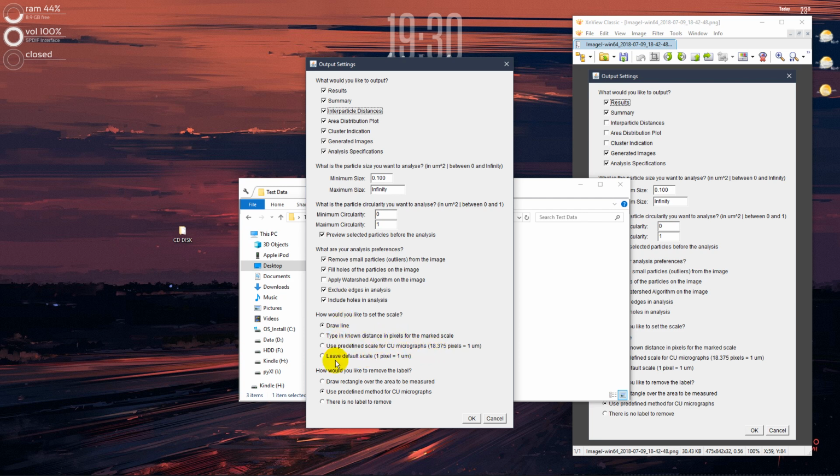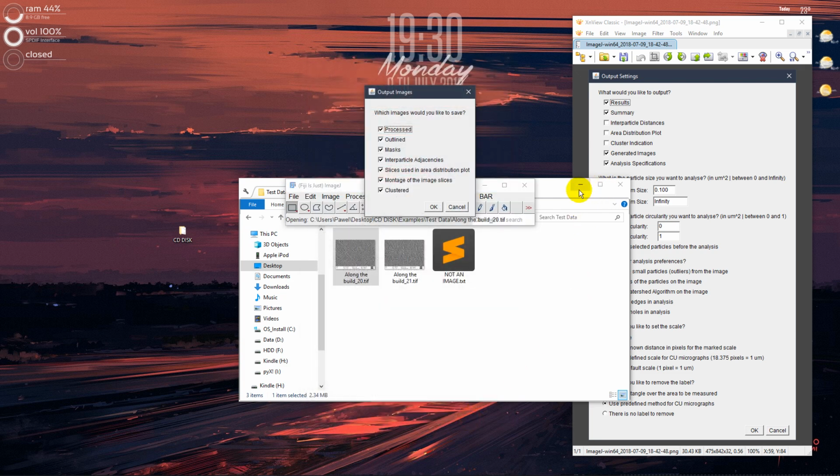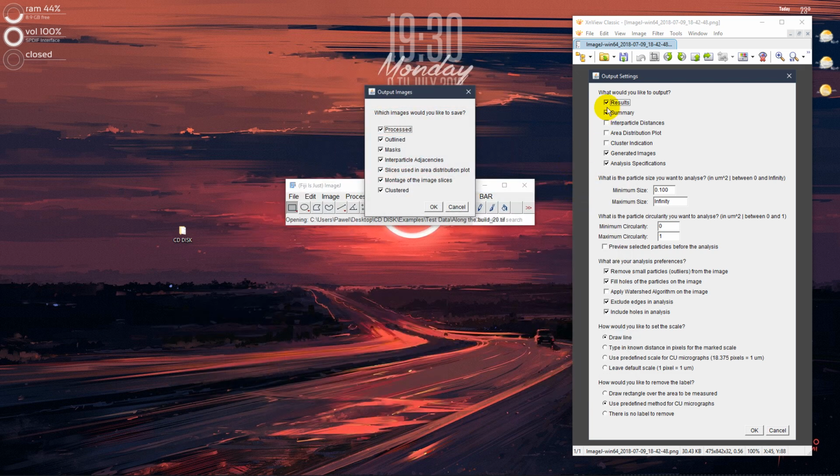Okay, so we'll select to draw the rectangle over the area to be measured to present how each option works, and use the most optimum settings. If I am satisfied with all the options, I click OK. Let's just close this window. This is only a screenshot of the menu, so I will explain by running the program what each option does.